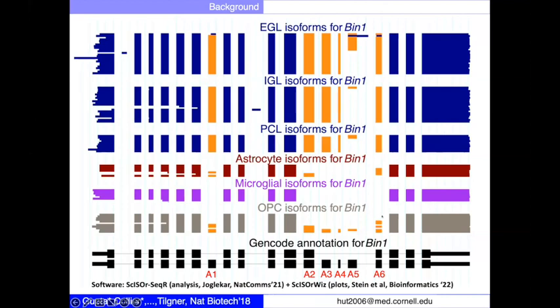So that means on top of the cell type specificity that is conferred by gene expression, we have added specificity in isoform expression. Now, what's going to be very important today is that, for example, here, the isoform that skips everything, we clearly thought was microglial or OPC, so in summary, non-neuronal. I'll come back to that.